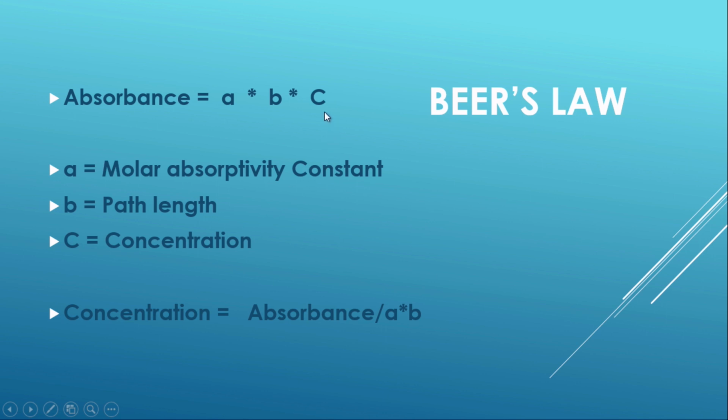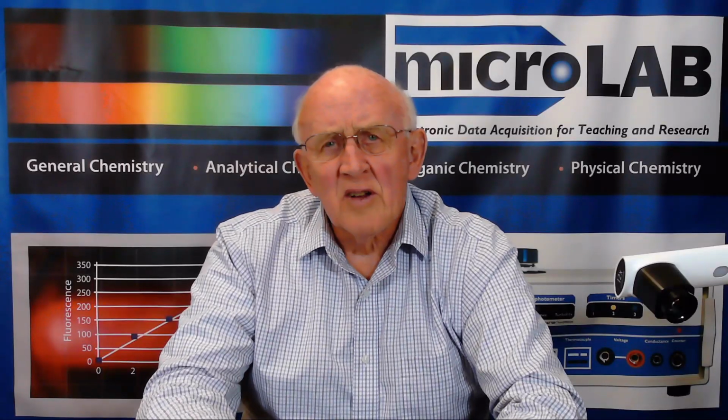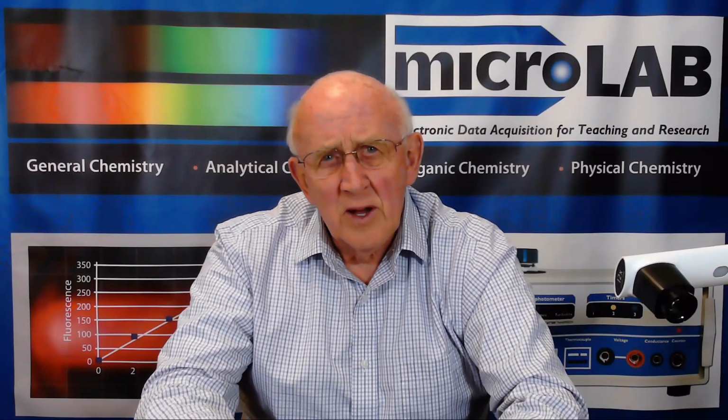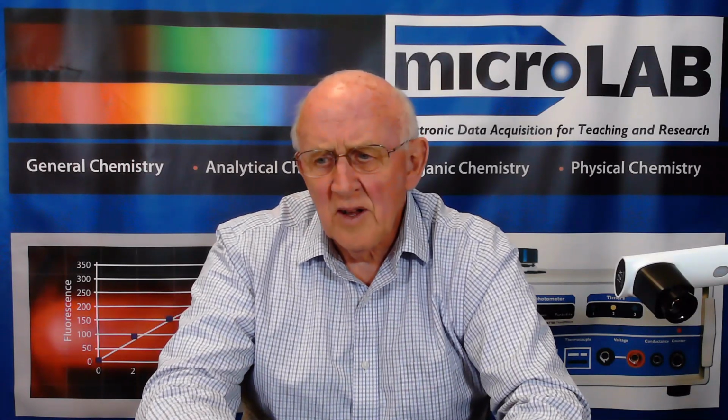If you rearrange this algebraically, concentration is going to be absorbance divided by A times B. The point of this is that absorbance is directly proportional to concentration. You can determine the concentration of almost any colored solution with this technique. Because it's accurate and fast, it's the favored tool for medical and environmental analysis.